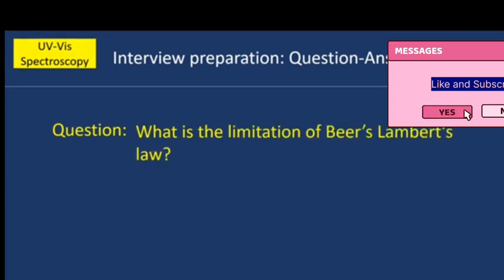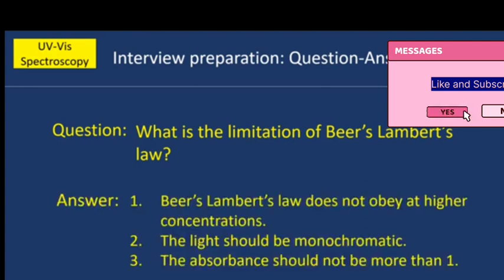Next question. What is the limitation of Beer-Lambert's law? The limitations are Beer-Lambert's law does not obey at a higher concentration. The light should be monochromatic. The absorption of solution should not be more than 1.